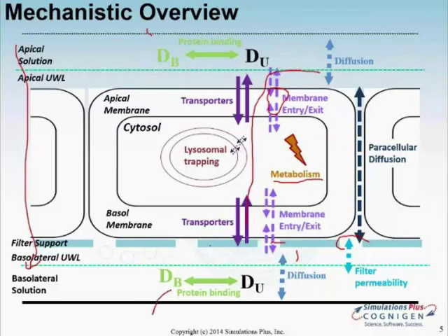media if you are running an assay with adding albumin or protein into your media, maybe to prevent excessive binding to the plates, or keep drug a little bit more in solution, or maybe accounting for more physiological conditions, trying to have protein binding on the basolateral side. These processes are accounted for in the system as well.